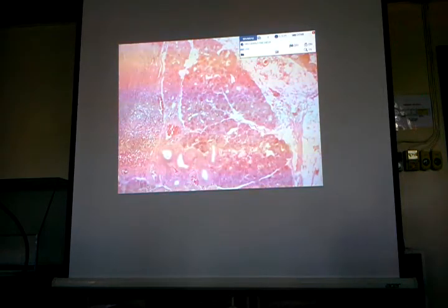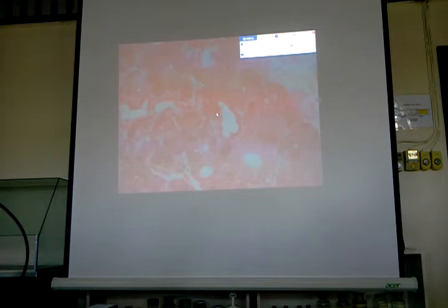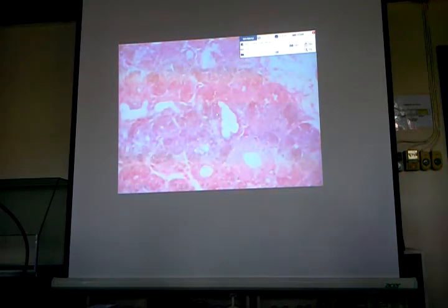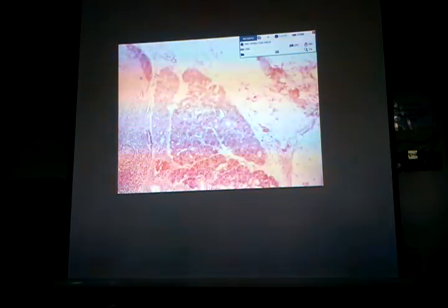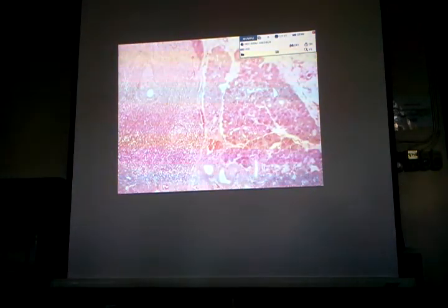Lobule. And because that duct is inside the lobule, it should be called an intralobular or an interlobular duct? Intralobular duct. Okay.